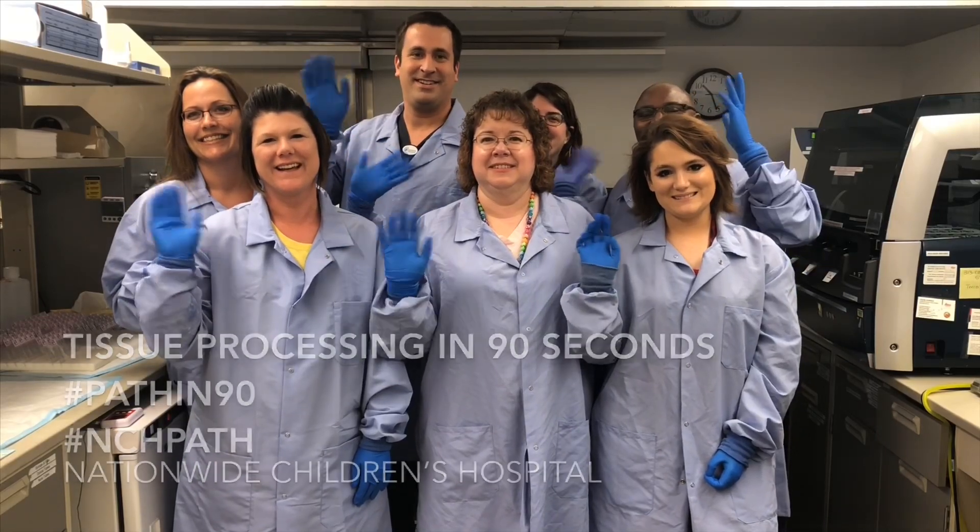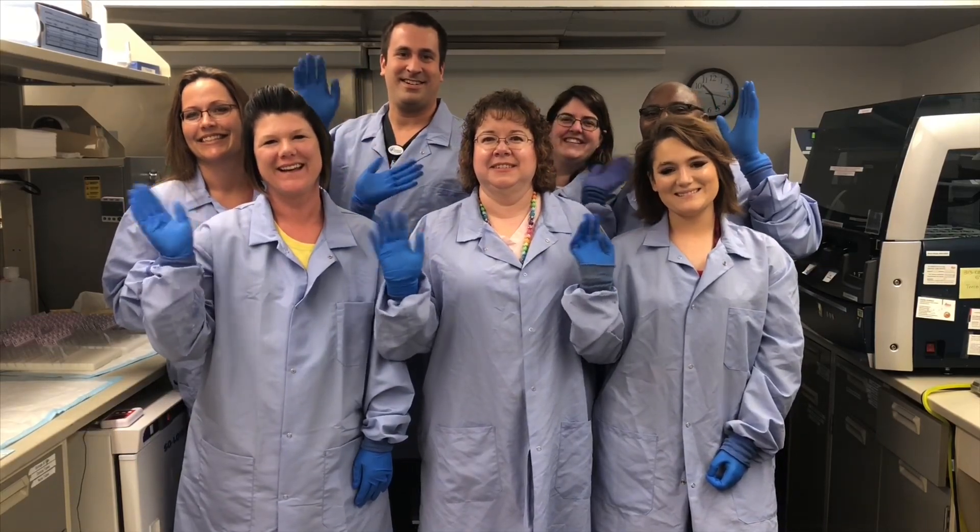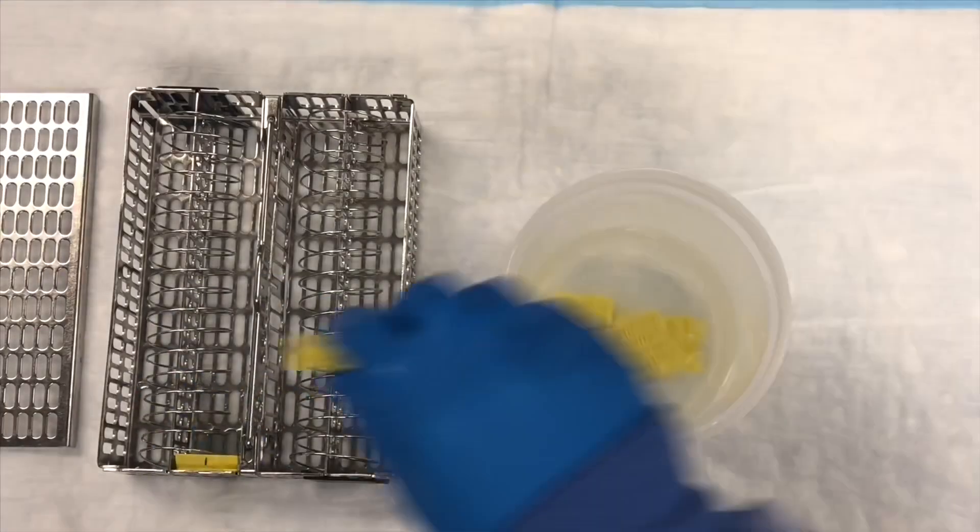Hey, I'm Mike. We are SAP Lab. This is how tissue gets processed in the lab in 90 seconds.